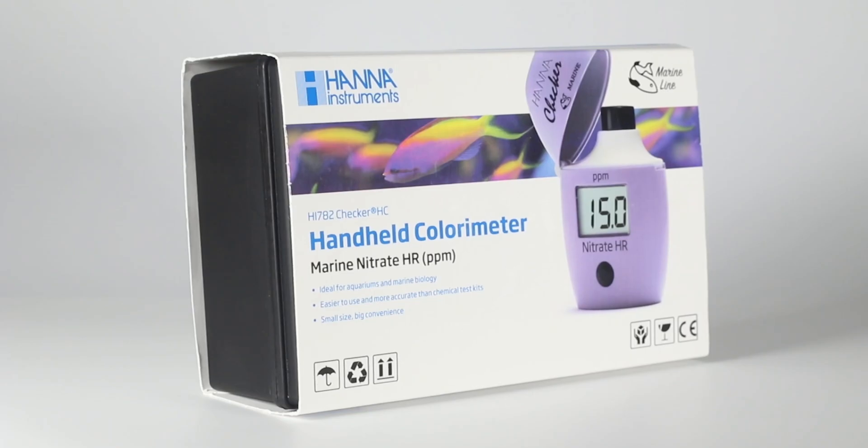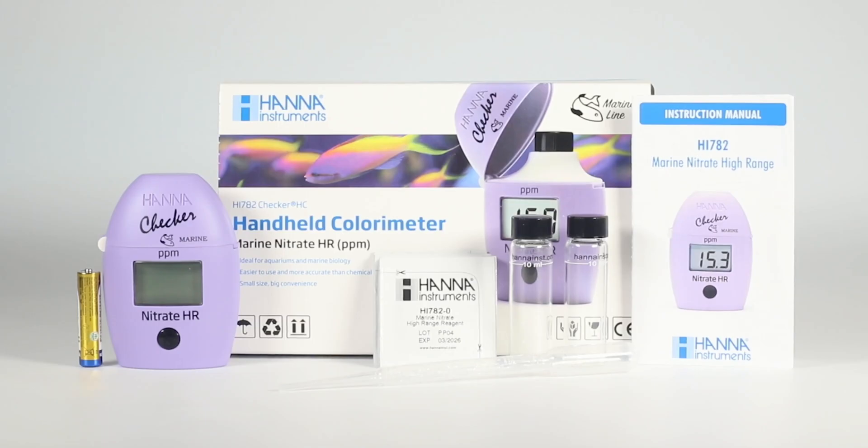First, remove the checker and accessories from the packing material and carefully examine it. If you require any further information, please contact HANNA Instruments' technical support team.